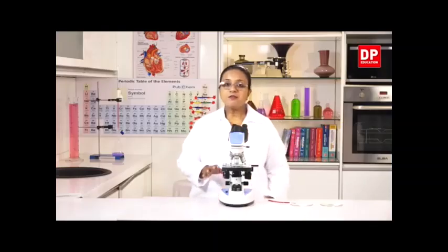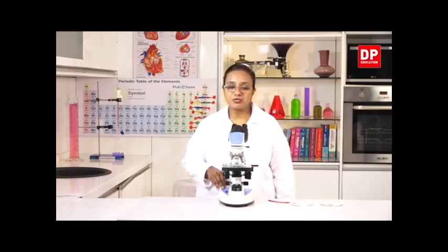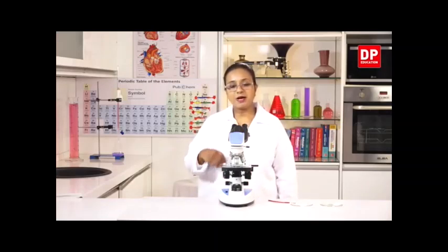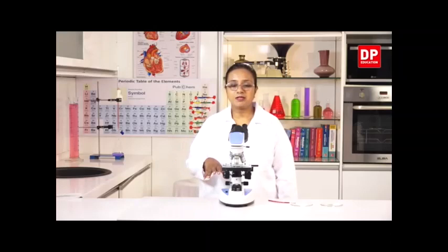So students, from this sample, the sample that was obtained from a student's cheek, the inner part of the cheek, we observe the cheek cells. They all look similar and they look spherical in shape. You can see the outline of the cells very clearly.